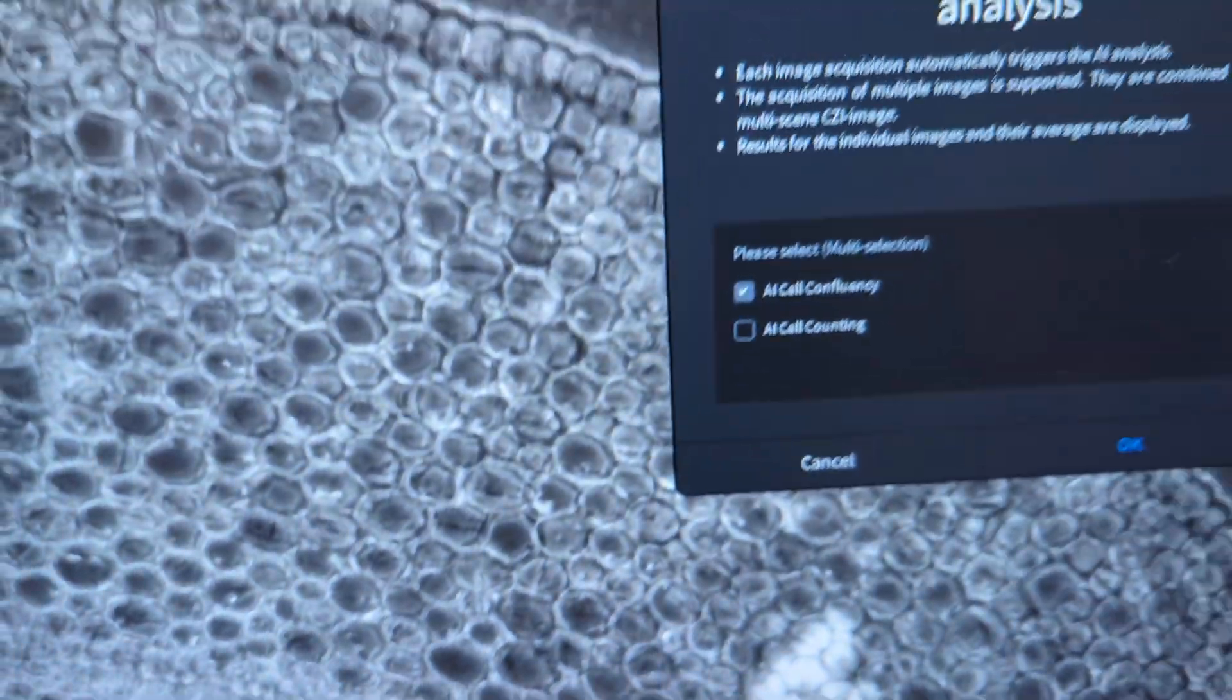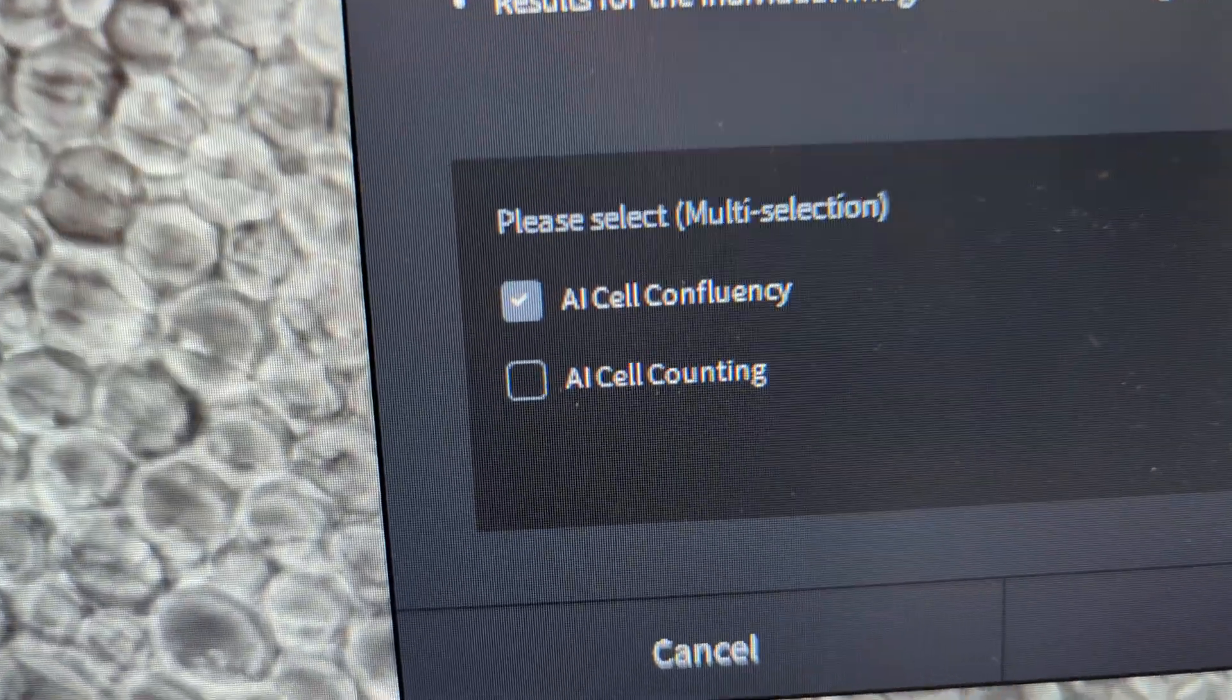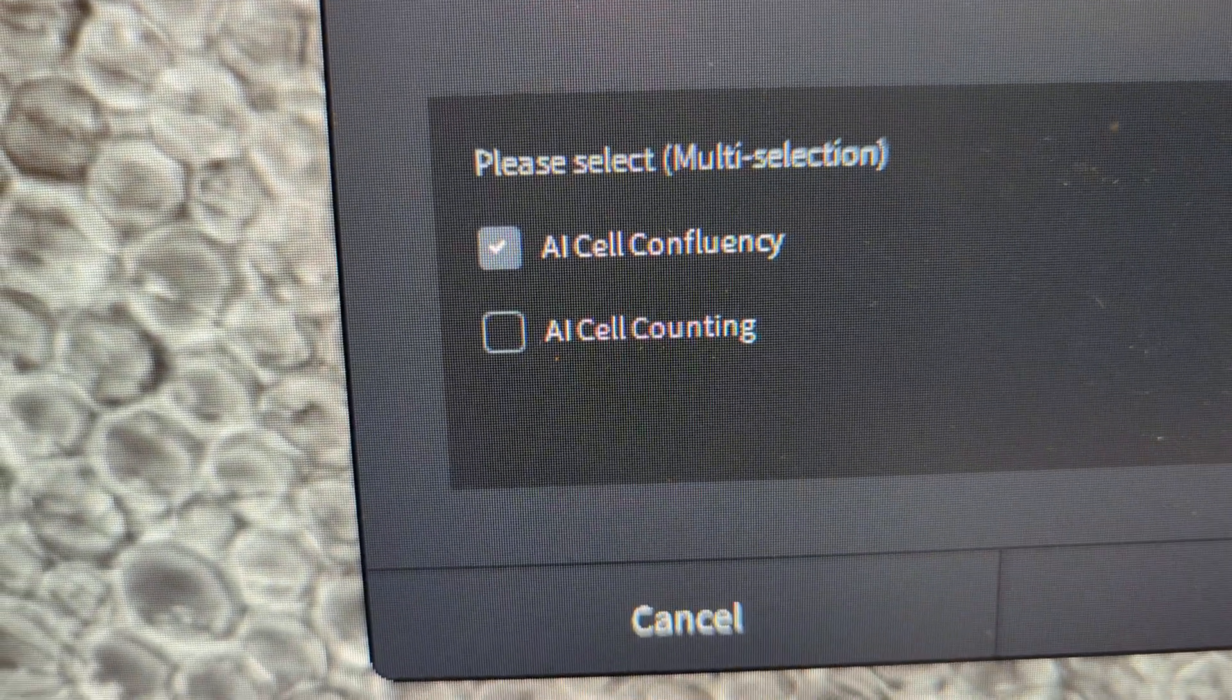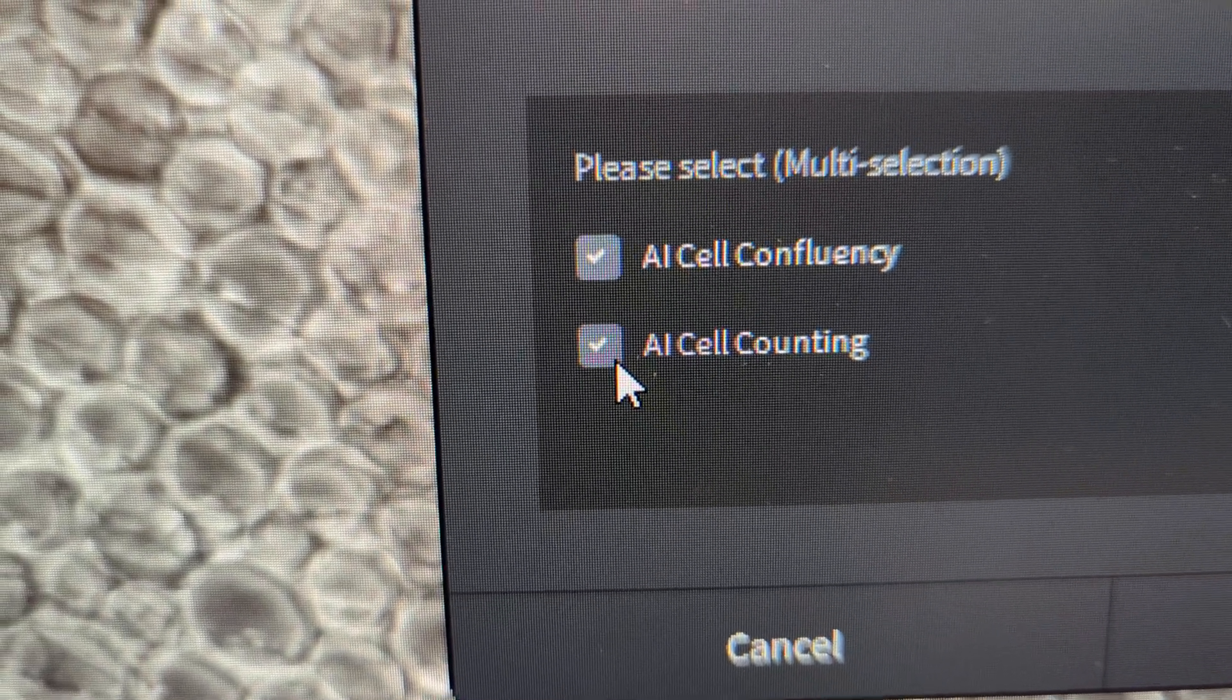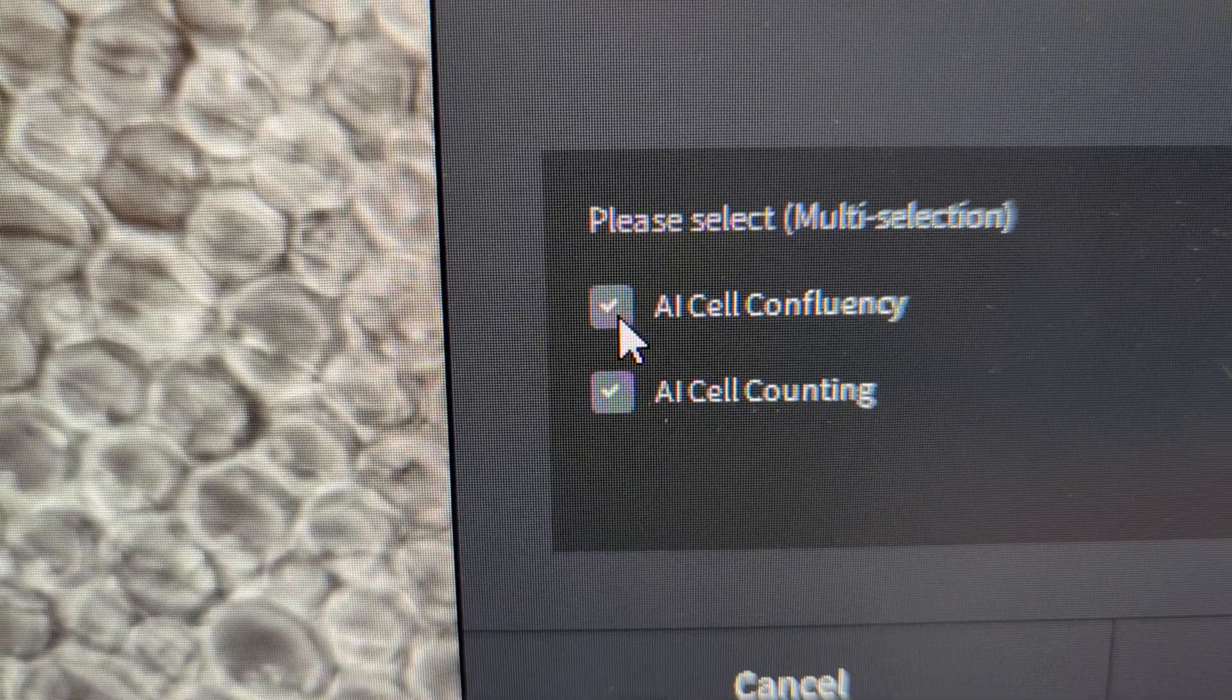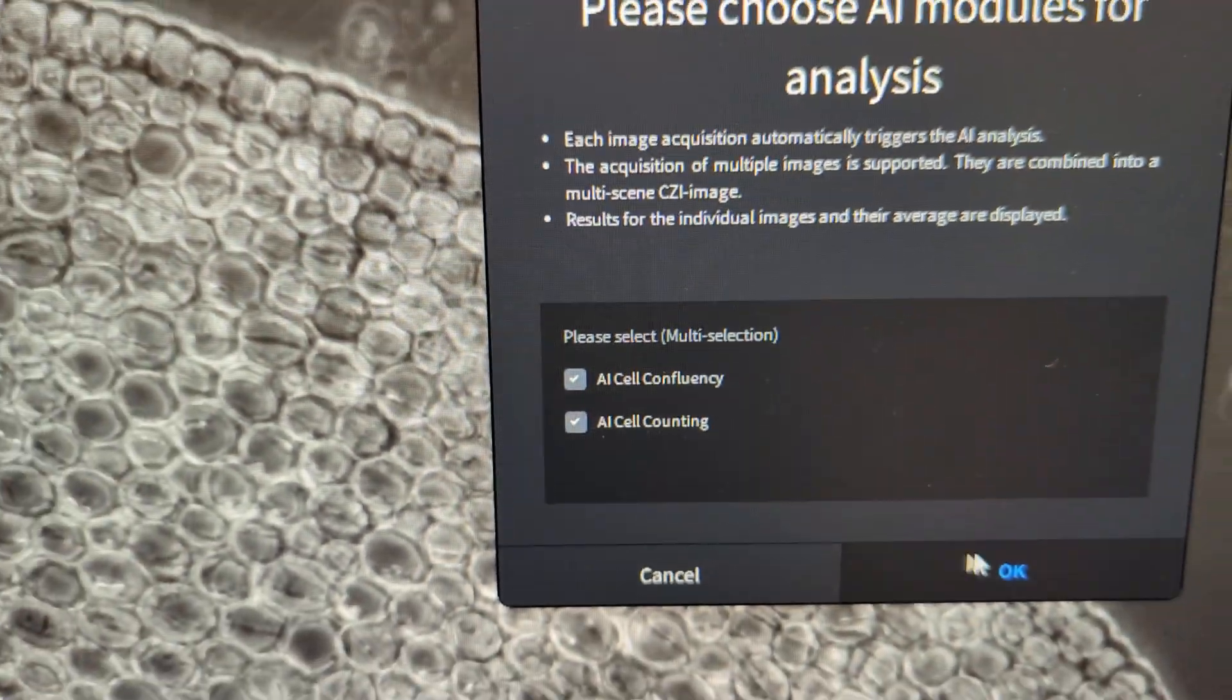These are your AI modules. The screen pops up, you'll have AI cell counting or AI cell confluency. I want to do both, so we'll check both. You can uncheck whichever ones you don't want, but let's just do both right now.